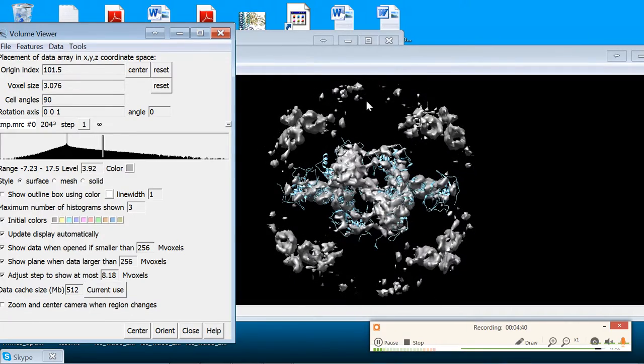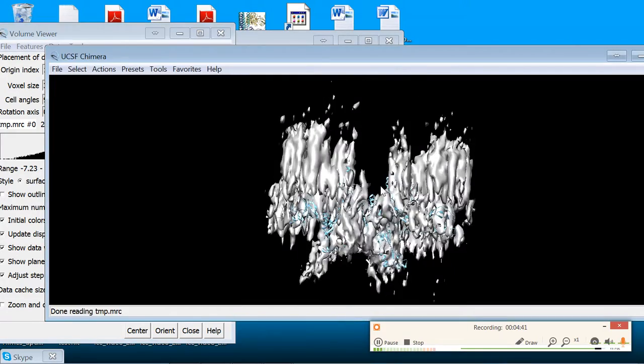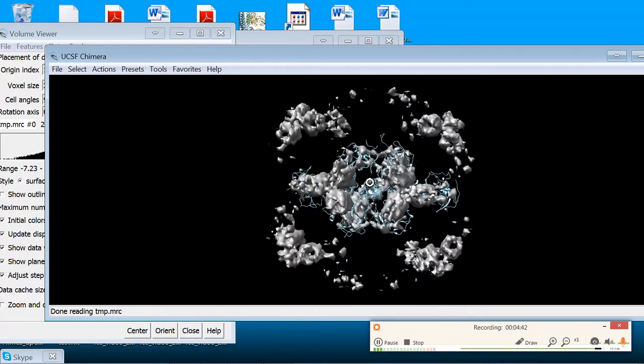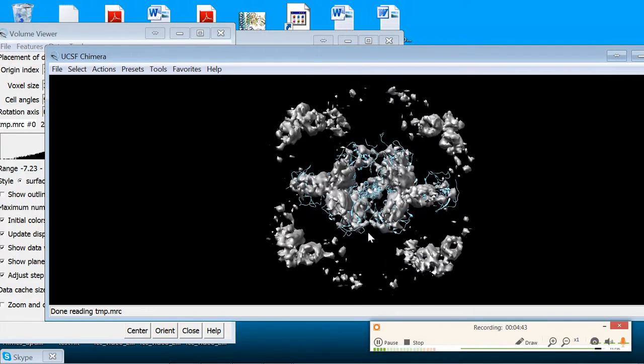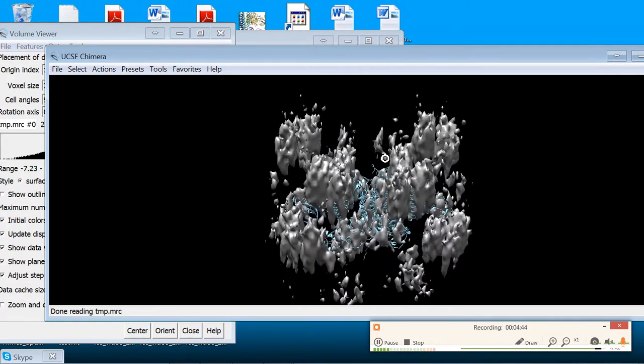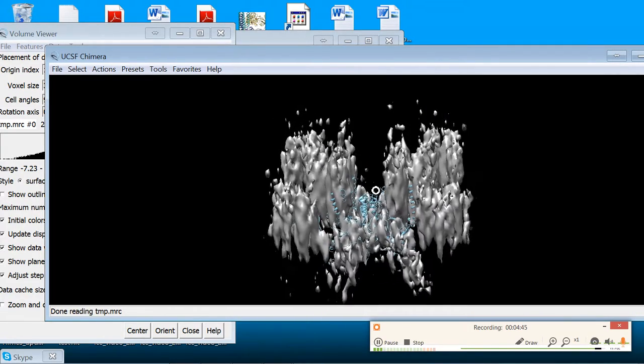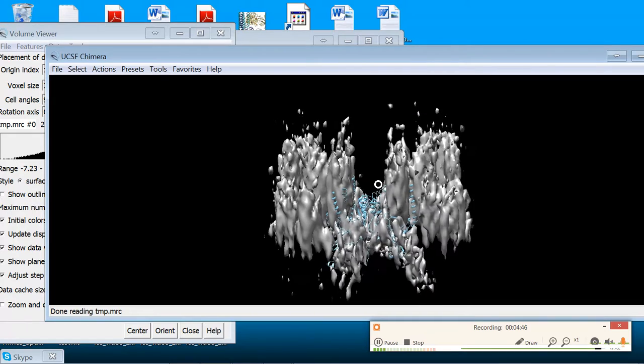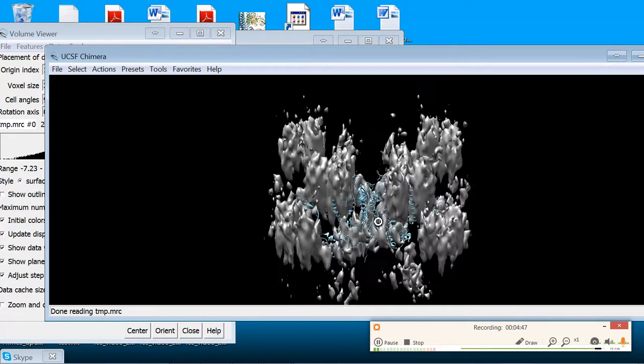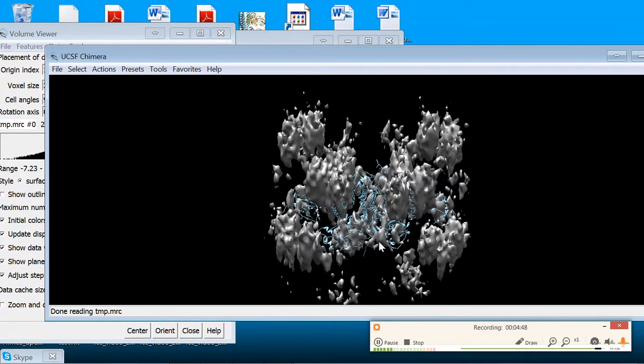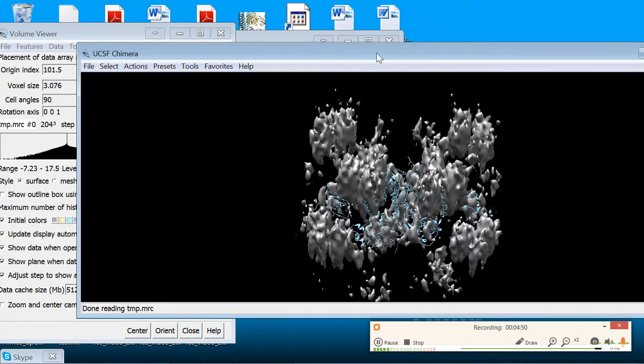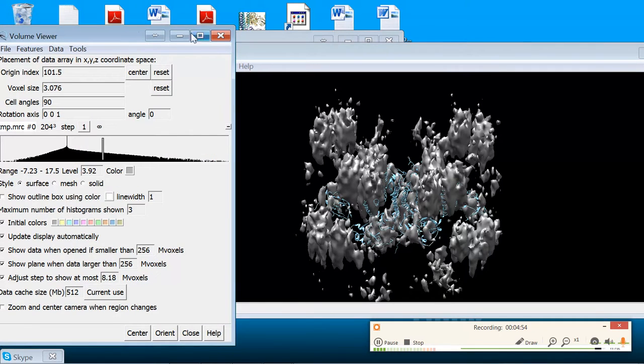And that now you have a map that is well aligned to the model. Now, I don't have VMD on this laptop. I pretty much just use this for Word and whatever else I have to unfortunately use Microsoft for. But I promise that if you open this in VMD, it will come out just the same.